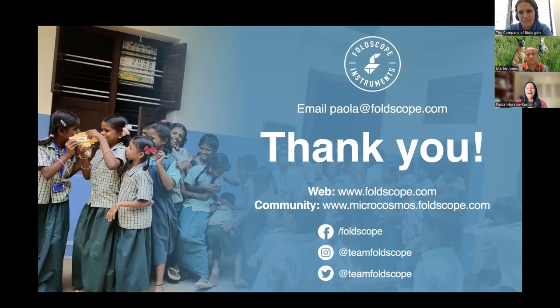Yes. Honestly, Foldscope is a great tool because it's super hands-on. Whenever I lead workshops in schools, it's a 5-6 minute introduction of what Foldscope is, probably the first few slides I showed you with that video, and then immediately hands-on. And my recommendation would be to link it to things they're interested in.